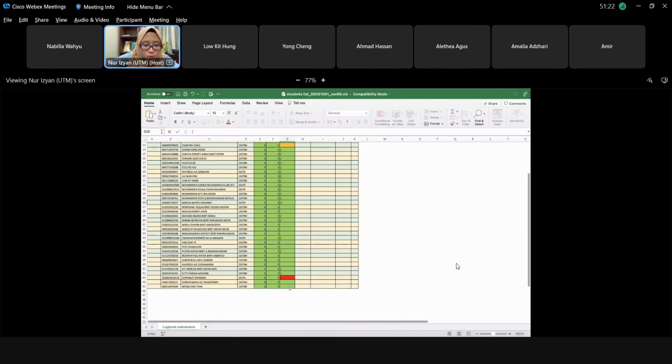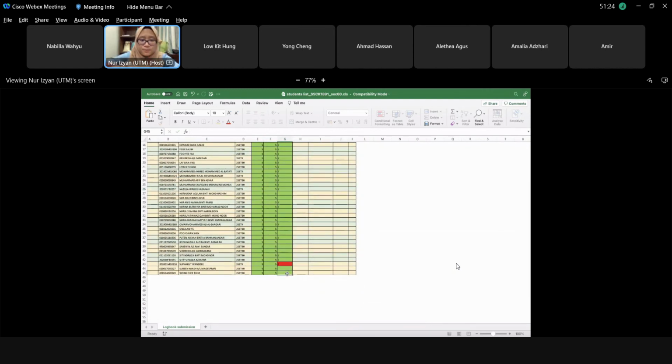Then I go upon Wong Chi Tim. Hello, Wong Chi Tim. There are several compartments in the AAS machine that have been combined together to operate it. One of them is the nozzle. What is the function of the nozzle, that small tube?